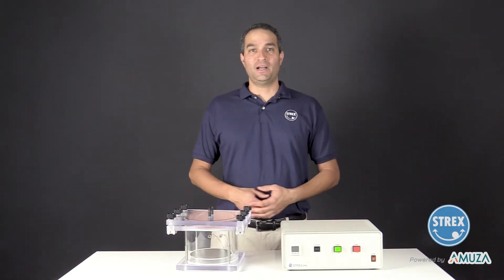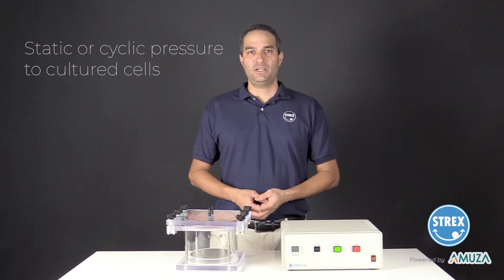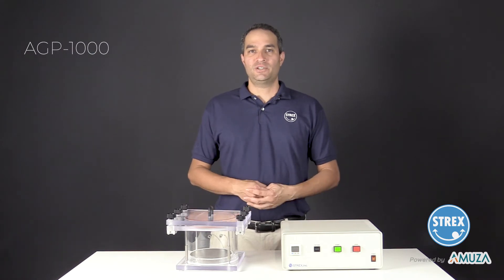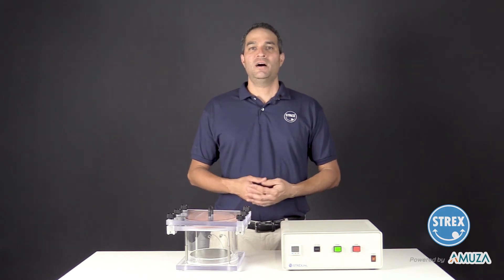Hi, my name is Derek from Strex. Today, I'm going to show you how to apply static or cyclic pressure to cultured cells using the Strex pressure system called AGP-1000. This allows researchers to mimic hydraulic pressure in vitro, which gives a better representation of physiological conditions on the benchtop.